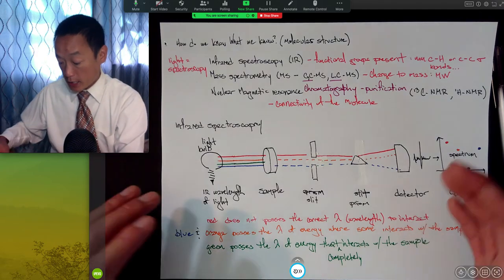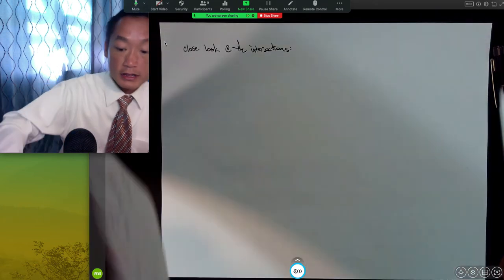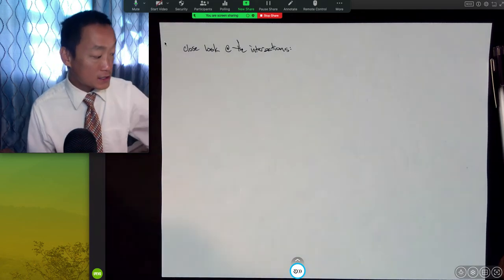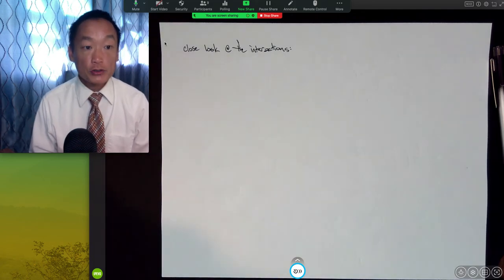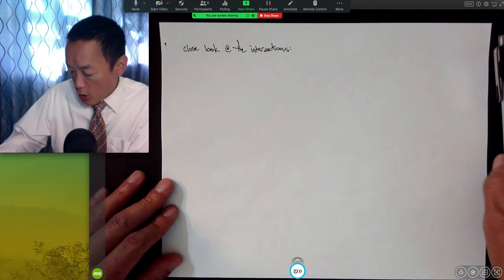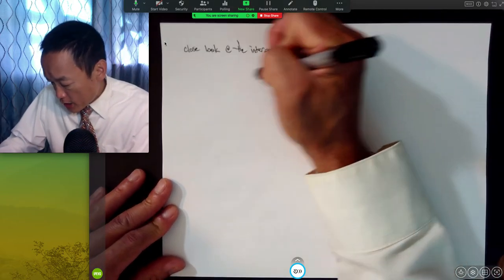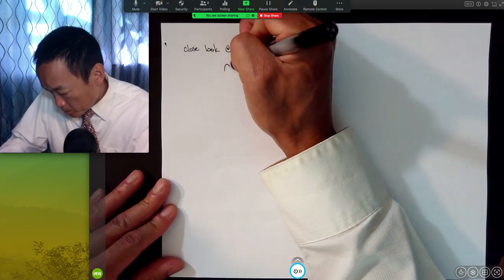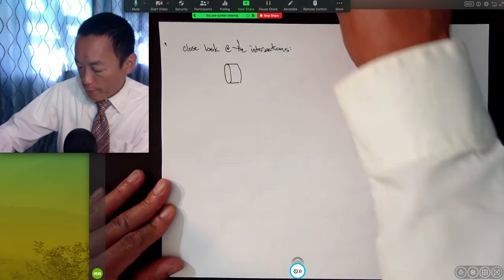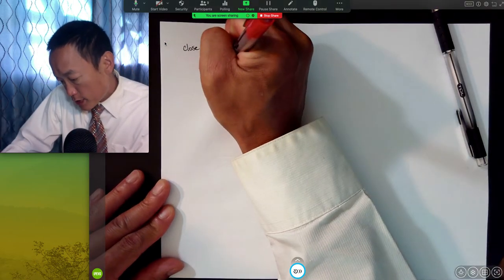And so looking at this, let's take a look at the actual physical interactions that are occurring between this light and our sample so that we can better understand why the spectrum looks the way that it does. When we look at the interactions that occur in this sample, we were looking at the idea of the red wavelength of light going straight through the sample.